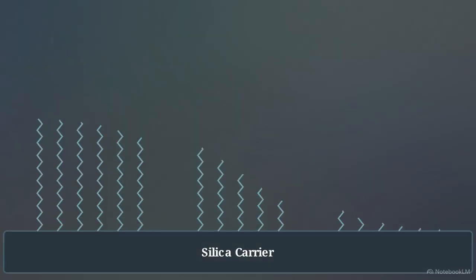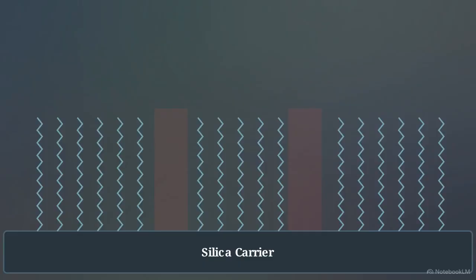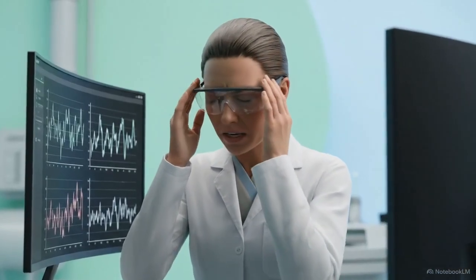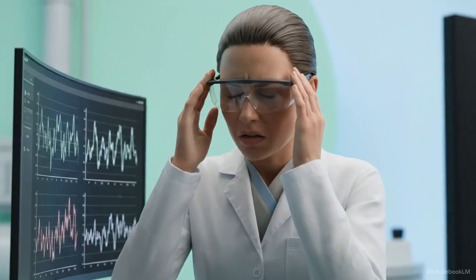This vector model shows why. Between the bonded C18 chains, distinct gaps leave residual silanol groups, SiOH, exposed. These bare silanols are highly reactive. When a basic analyte enters, it chemically sticks directly to those exposed groups. This chromatogram shows the result of that chemical sticking. Instead of a clean exit, the elution is severely delayed, creating an asymmetrical, dragging shape known as peak tailing. Relying on a standard ODS column for basic compounds guarantees these secondary interactions. That leads directly to system suitability failures and compromised QC reproducibility.